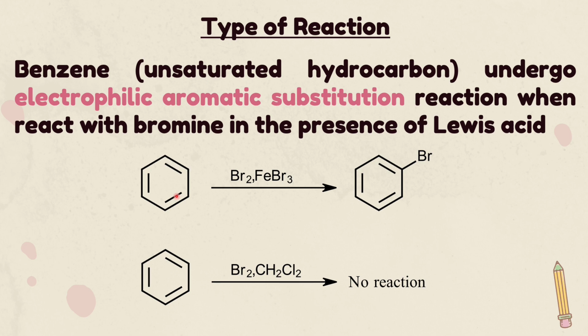Okay, tapi kalau kita buat dekat normal, dekat room temperature ataupun awak setakat heat sampai 100 degree ke apa, the benzene itu will undergo aromatic substitution. Okay, bermaksud we're going to substitute one of the hydrogen dekat sini dengan something else lah. Okay, so kalau kita treat benzene itu macam kita treat the alkene, maknanya kita reactkan dengan bromine in inert solvent, what we observe is there is no reaction happen.